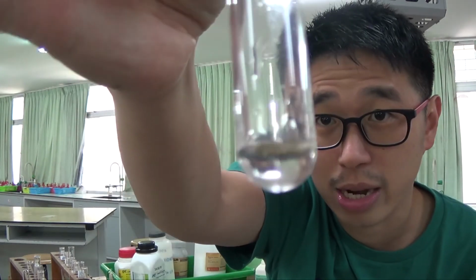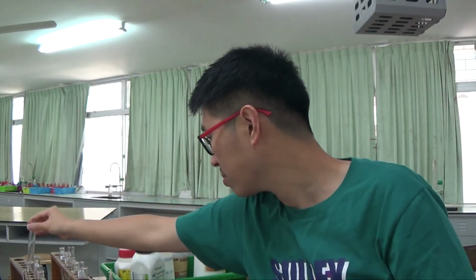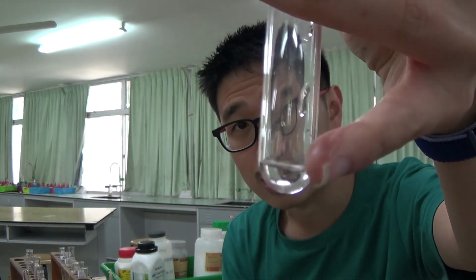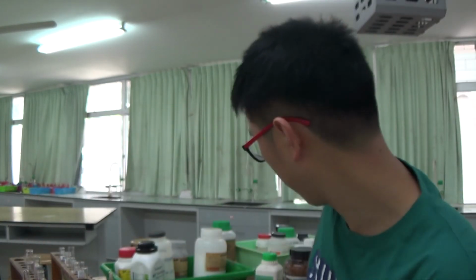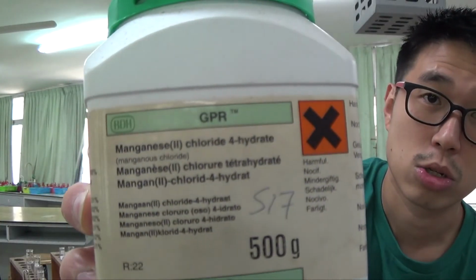Anyway, this solution is clear. This is the one with a little bit of browning in the test tube. It's not a result of this reaction. It's just there in the test tube already. Okay, so the solution is clear. This one contains manganese 2+, and it contains Cl- because I started with manganese 2 chloride.